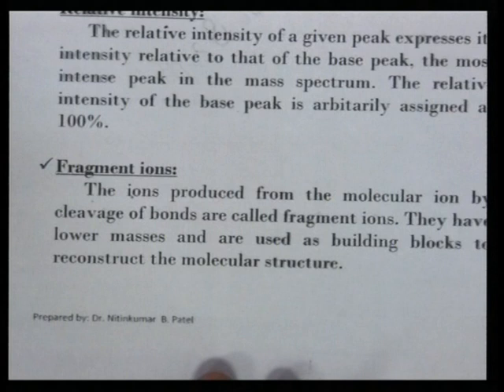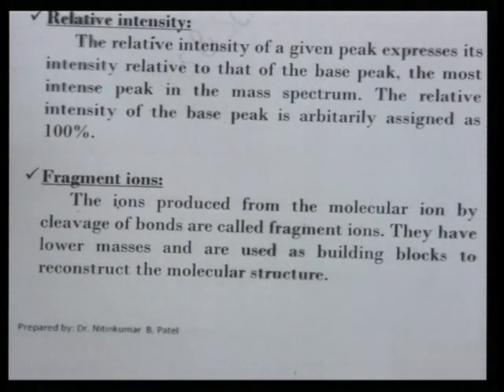Another term is fragment ion. The ions produced from the molecular ion by cleavage of bonds are called fragment ions. They have lower masses and are used as building blocks to reconstruct the molecular structure.